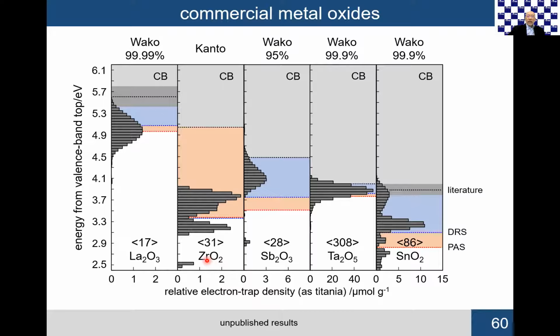Pure zirconia, silica, or alumina don't give the ERDT pattern, but contaminated or doped material gives the ERDT-CBB pattern. And that does not depend on the specific surface area. Of course, those detected electron traps are located on the surface, but this may not have a constant surface density.